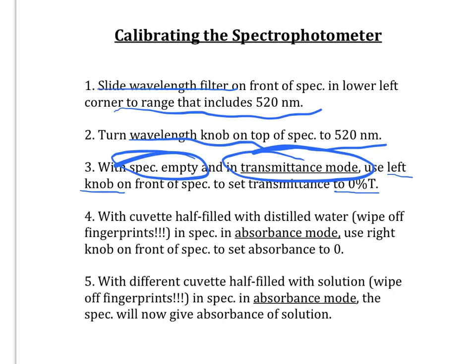Step four, take a cuvette, fill it halfway with distilled water. Usual story, wipe off the fingerprints to make sure they're not blocking any light. And put the spectrophotometer, this time, in absorbance mode and turn the right knob, if you need to, to get the absorbance to 0. And again, that's because Beer's Law says when the molarity is 0, meaning pure water with no solute, the absorbance should be 0.